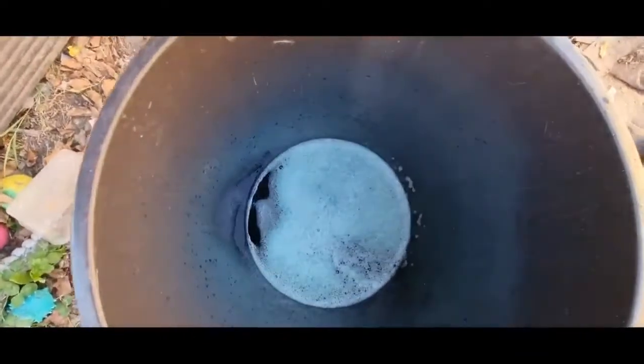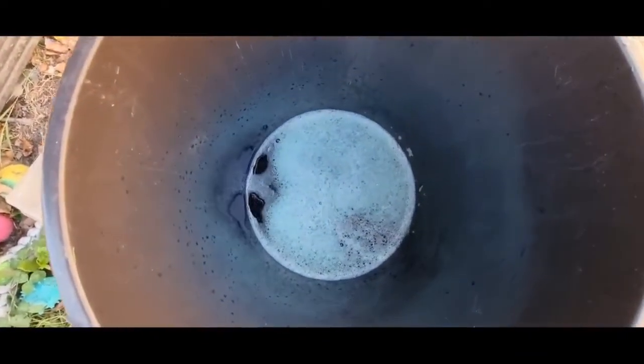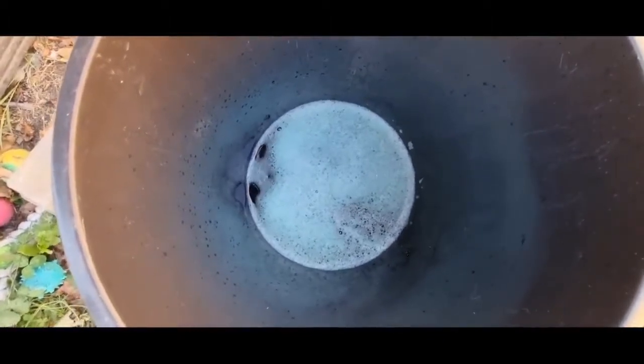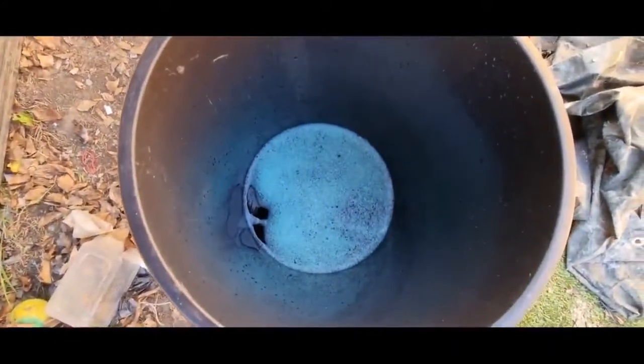All we're going to do is chuck in some aluminium and it'll keep reacting with it and dropping the copper out of the solution. I'll just keep adding aluminium until all the copper is out — you'll be able to tell by the colour. Afterwards the copper will just be a powder so it doesn't matter if there's any stickers or anything on it.